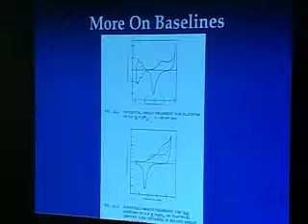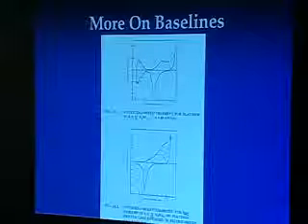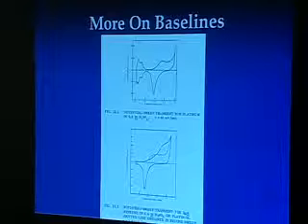Questions on that? Because being able to see that is usually very important. If you don't see that, by the way, you throw your electrode in and it looks more like the bottom panel than the top panel, and you want to get it to the top panel, often you can just scan in sulfuric acid, which is a good one, 1 molar, half molar, between oxygen evolution and hydrogen evolution. Just keep scanning back and forth, usually for a couple hours, 100 millivolts a second maybe, and you will develop this pattern over time, and once it's developed, you have a clean electrode.